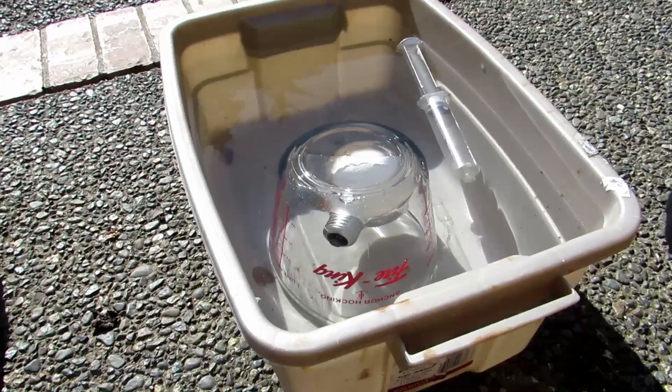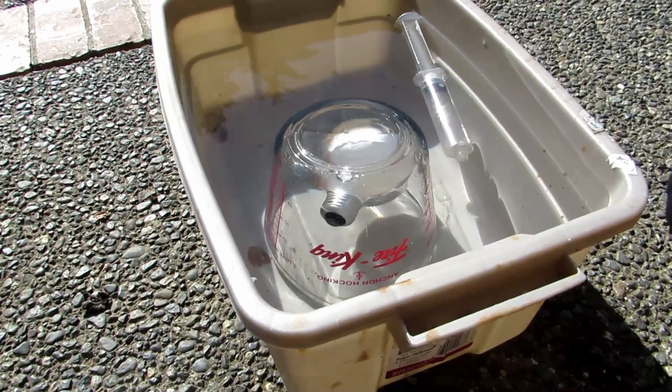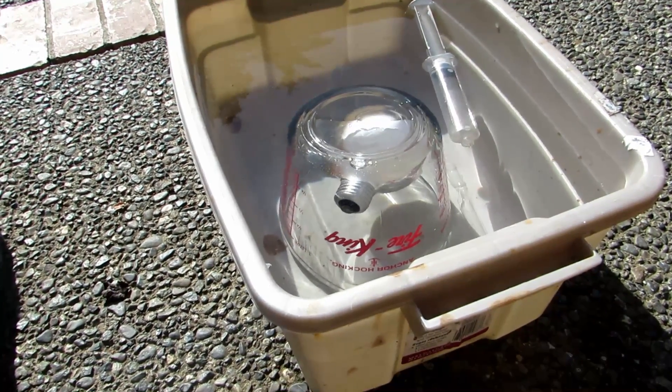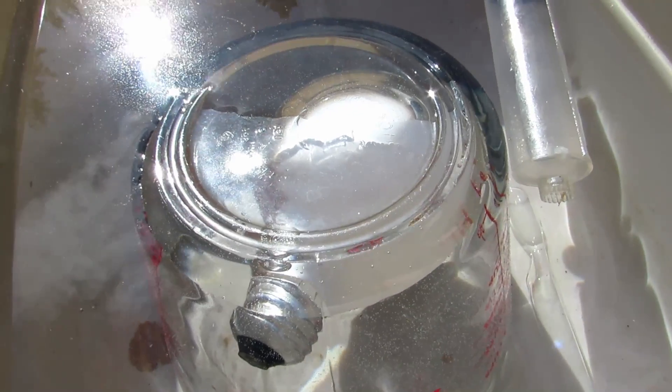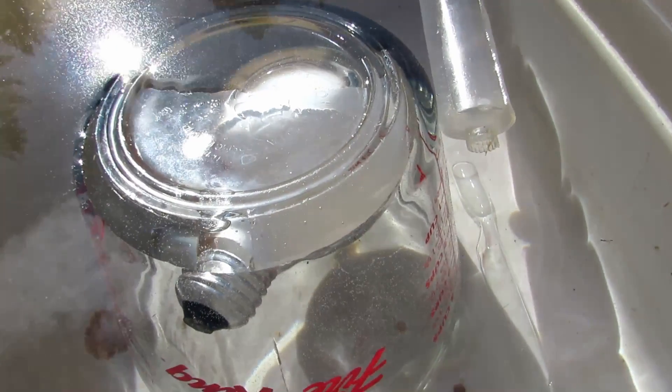Hey guys and welcome back to how to make elements from household materials. Today's element will be argon. As most people know, argon is inside of most light bulbs, and I have a light bulb inside this glass measuring cup right here. It's a rather large light bulb, and this will be our source of argon today.